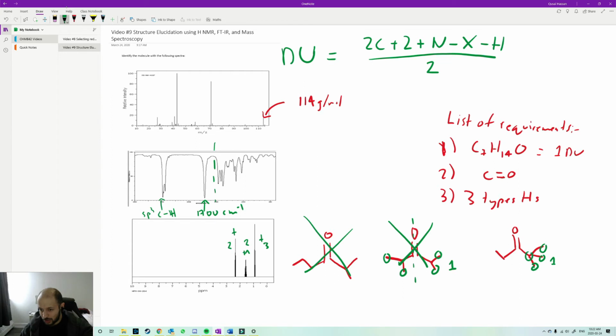There's no hydrogens here, so that's actually not gonna be a peak, right? Oops, sorry. Right, because carbons only take 4 bonds. That's going to be my 2, and that's going to be my 3. Okay, well, this might work, right? I got 3, that looks like it's going to work.